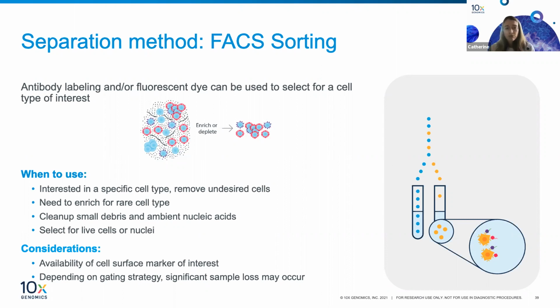This can be a really versatile, great technique, but you do need to make sure that you're working with a flow facility or personnel that have experience with flow sorting and that can take into consideration ways to minimize loss of your sample and minimize the harshness on your cells. We have some guidelines in the Q&A section for sample preparation on the 10X support page for considerations for flow sorting of your cells.